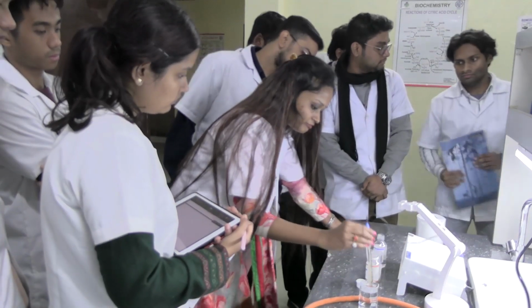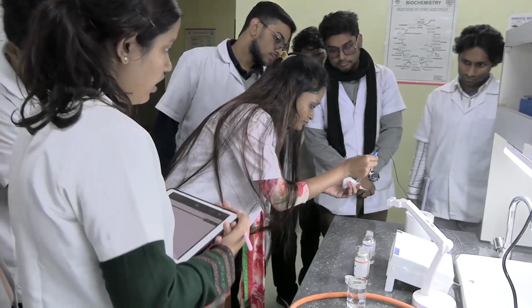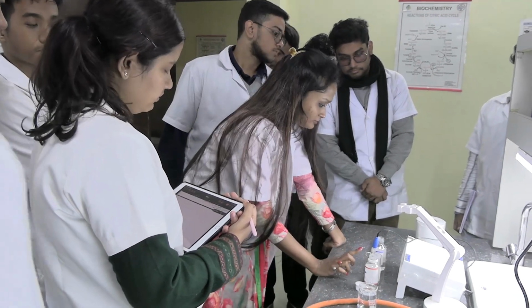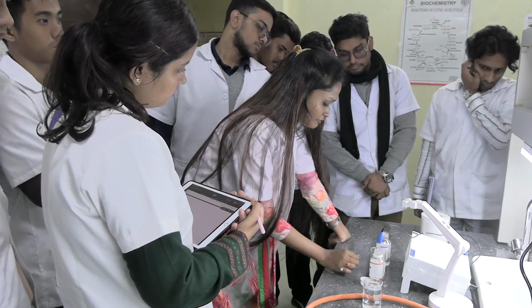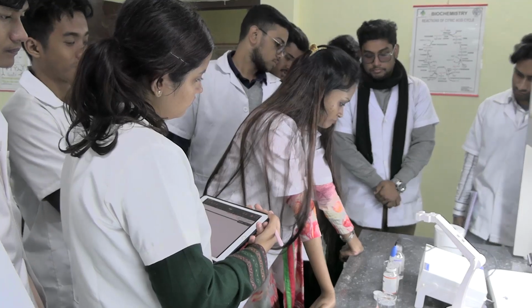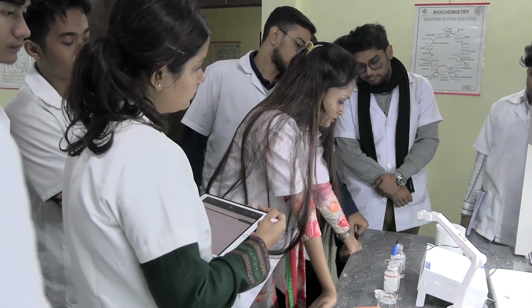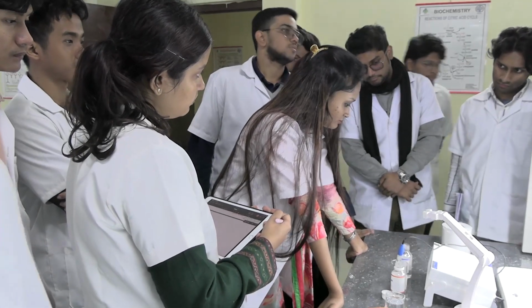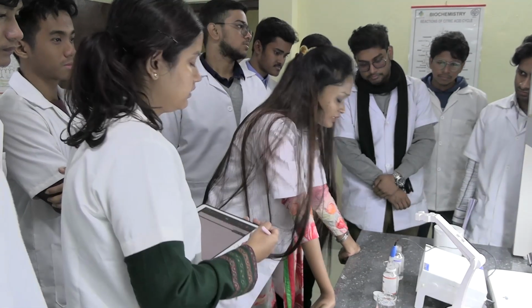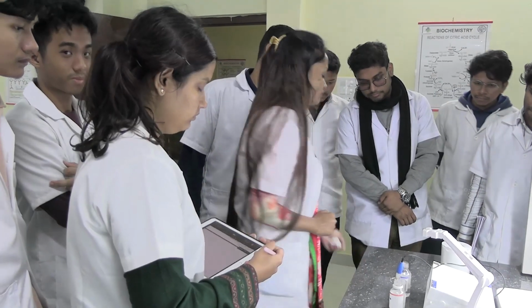Again wash it. So this is the electrode bulb. Again wash it and dip it. This is our unknown solution. This solution we have taken is sodium hydroxide. What is the formula of sodium hydroxide? NaOH. So the molecular weight is 40: 23 plus 16 plus 1, total 40. Okay. So come here.